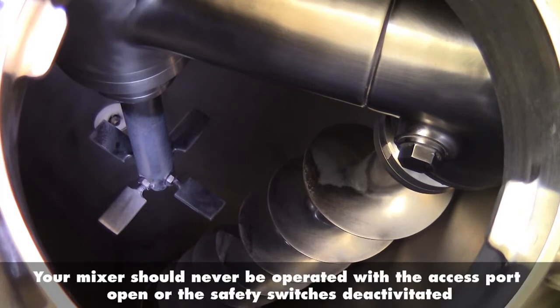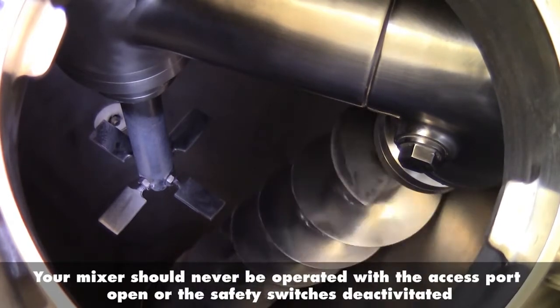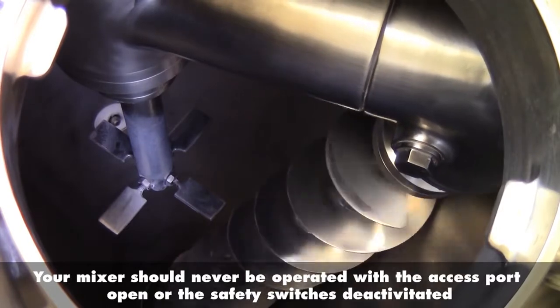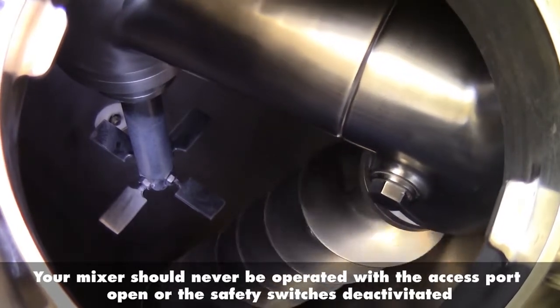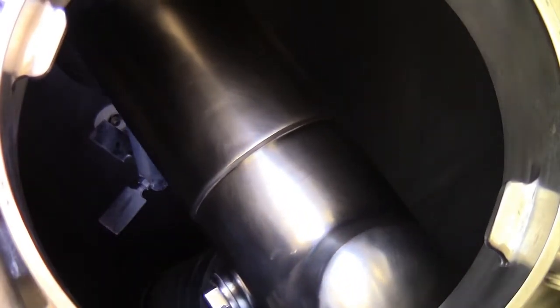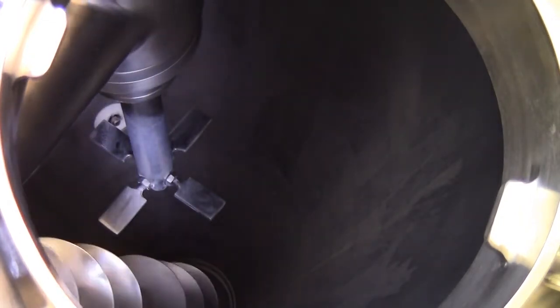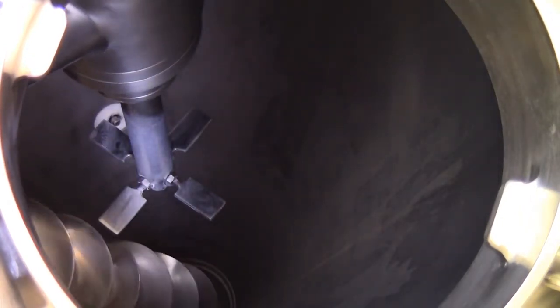We'll now start the unit. You can see the auger start to rotate, and you can now see the orbital arm also start to rotate. The mixing in this type of mixer occurs as the material is transported from the bottom of the mixer up through the top by the auger. The location of the auger is changed by the orbital arm to mix the entire batch.